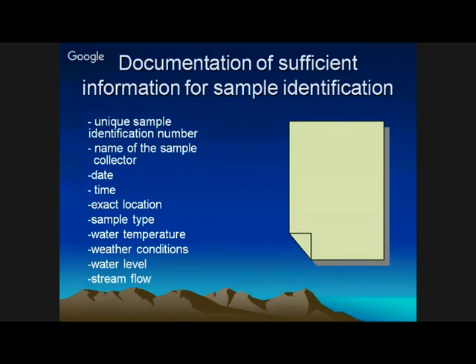Documentation. Once it reaches the laboratory, the person should know exactly from where the samples have been collected and who has collected them, so that in case of any legal consequences, or if you have to file this report to the court, you have documented it properly. So these are the examples that I have given, and this is the format that you have to indicate on the sample sheet, which should accompany the sample to the laboratory.